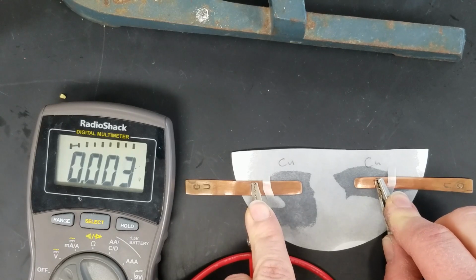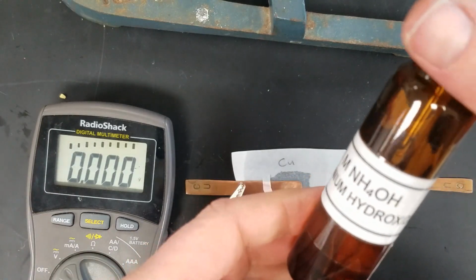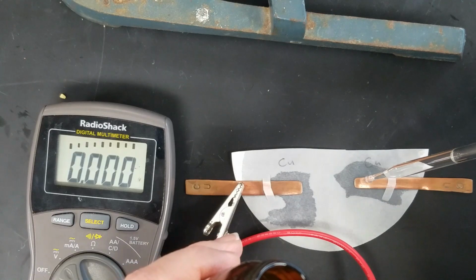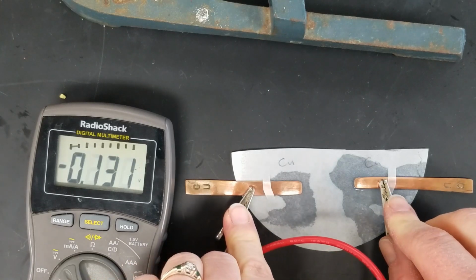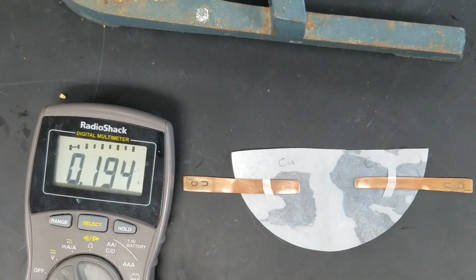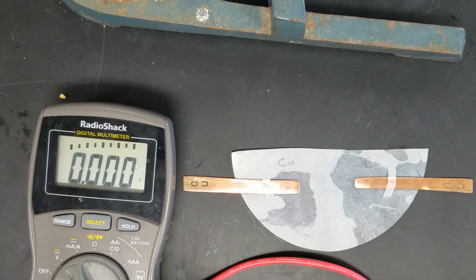Our concentrations are equal. We're going to now adjust the concentration on the right side of our cell by adding 4 drops of ammonium hydroxide. This forms a complex with the copper, not allowing it to be available. And so we are going to now measure our voltage. You want to use the voltage that you initially saw for the voltage of this cell. So you can see that when our concentration changes, our voltage also changes. And you'll be able to calculate the equilibrium constant for the formation of that complex using this voltage.